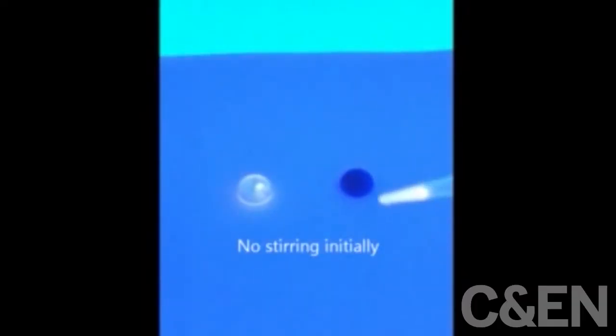Although the stir bars are too small to see with the naked eye, there are about 400 million of them in the droplet on the right.